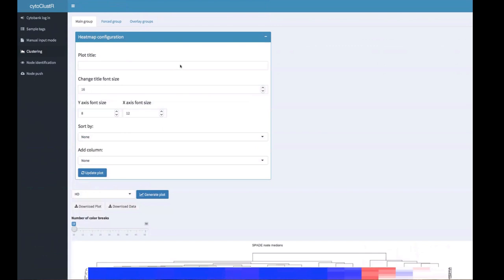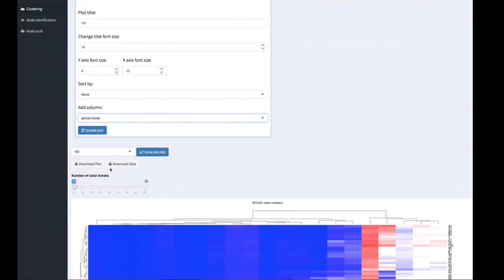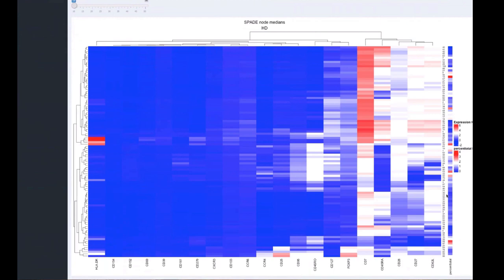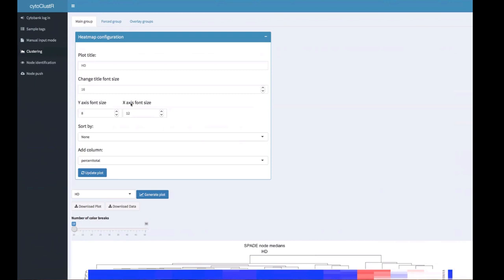You can configure your heat map in the menu: add a plot title — here we add 'HD' for healthy donors — and you can also add columns. It's useful to add the percent total to understand the abundance of each node in your data, giving a fraction of the cells clustered within each SPADE node.